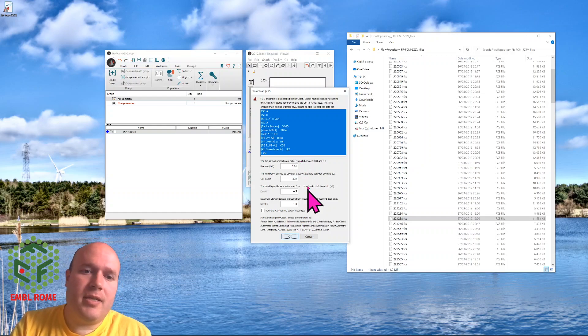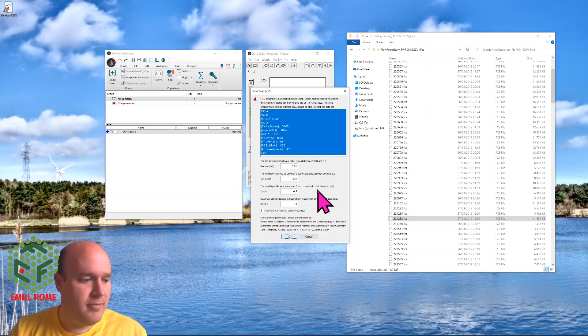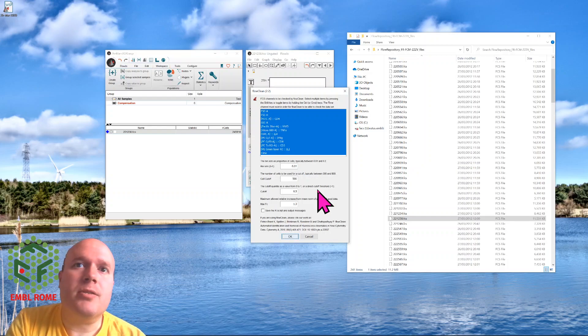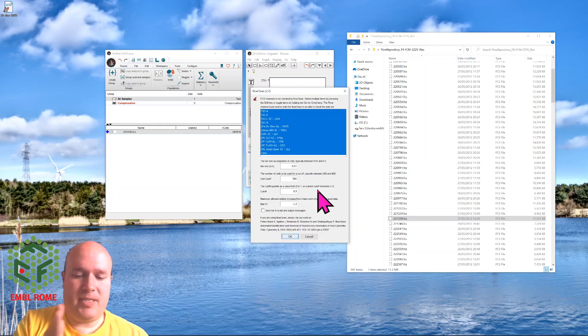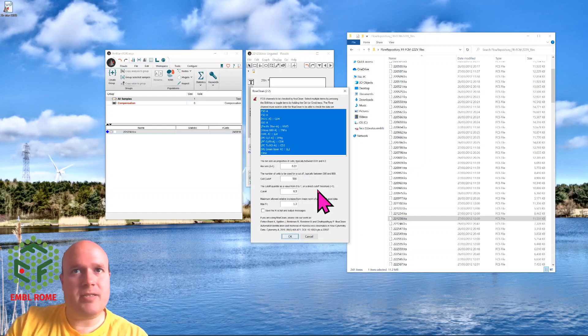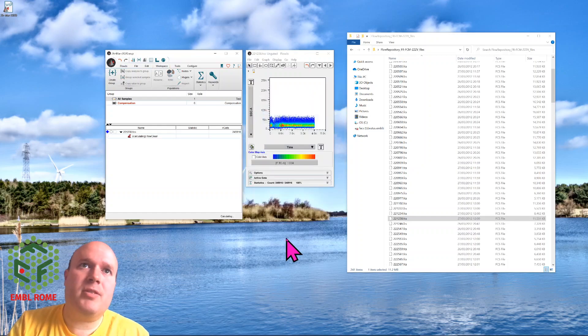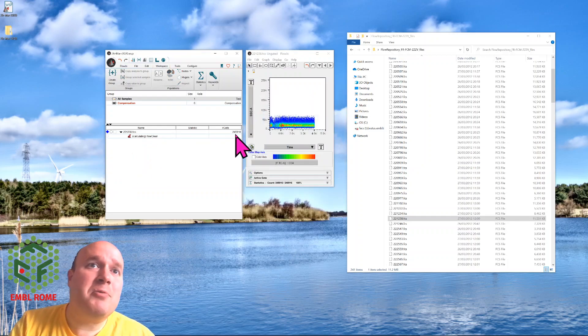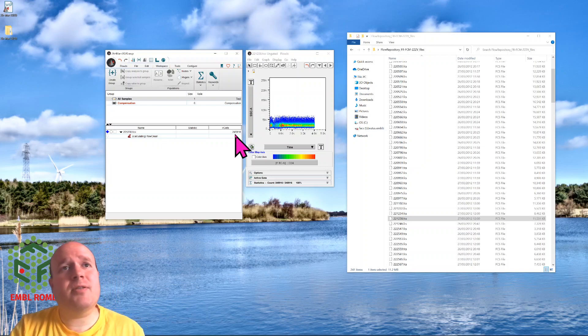These are the parameters for FlowClean, the settings for running FlowClean. If you read the paper, you'll discover what all these are. Basically FlowClean splits the data into chunks and looks for deviations between the chunks. I'm just going to accept the defaults and press OK. It's going to run FlowClean. There's 250,000 events here, so it'll take a few seconds.